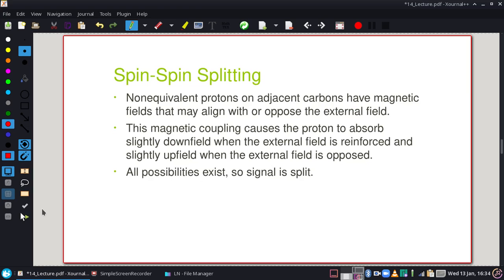All right, next thing we do before we start identifying things is we talk about other things that will split up or help us identify things. What we're going to look at now is the fact that the hydrogen peaks that we see will split if they're near other hydrogens. What I mean by that, let's think about a very simple alkyl group, the ethyl group.